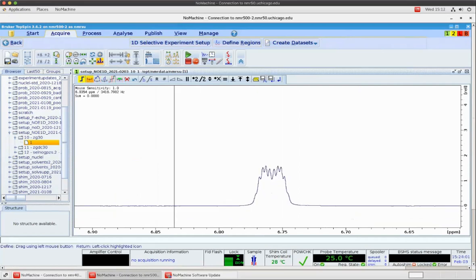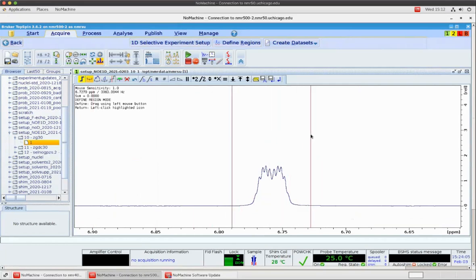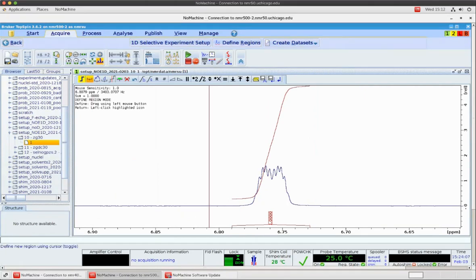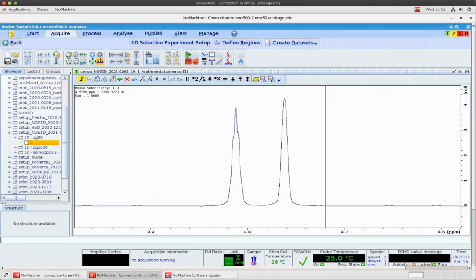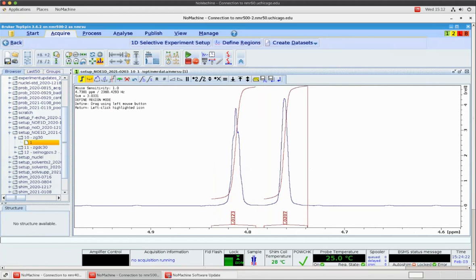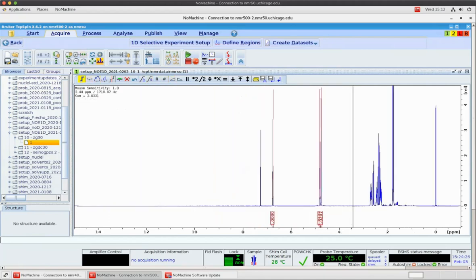And then we click over here, just like we're integrating. Click there, and we integrate. We unclick that. We look at our full spectrum. Let's take a look at these two peaks. We'll get this one and this one. And maybe a couple of others, huh?